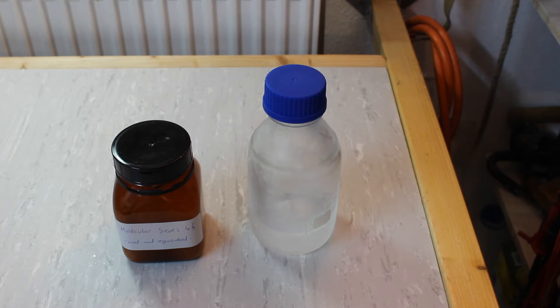Hello and welcome to Chemex. Today we'll be purifying and drying the diethyl ether we made in our previous video.